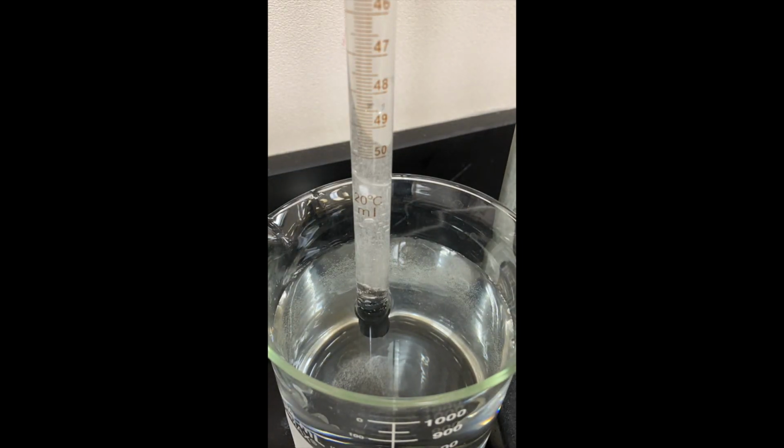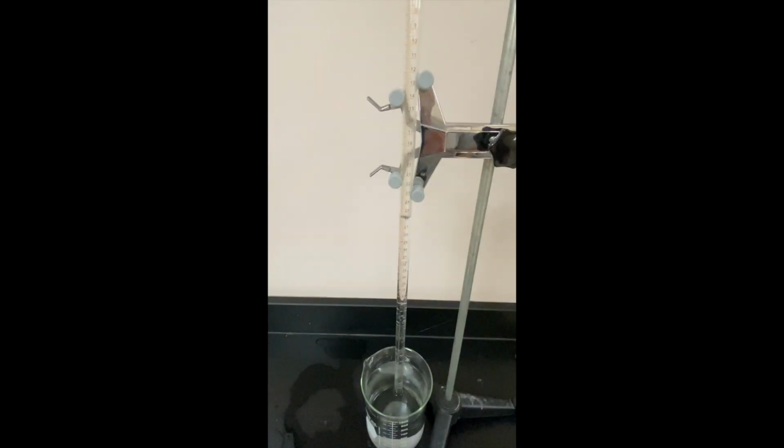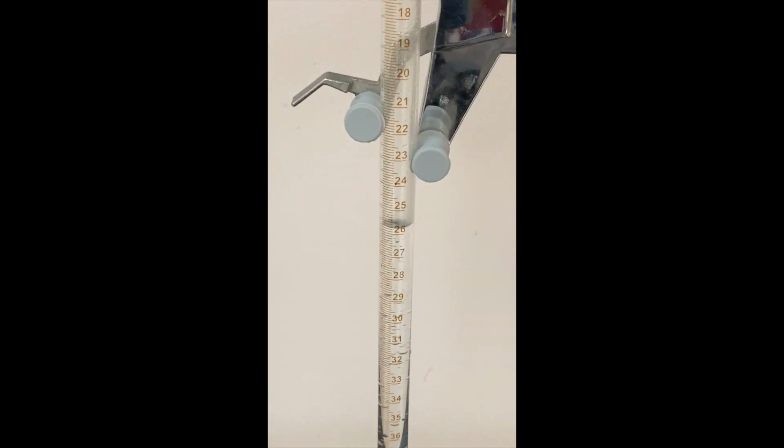All right, if we speed this reaction up, the magnesium and the hydrochloric acid react. You can see all of the bubbles. Once the bubbles stop, we know the reaction has stopped, and we can look at the volume of gas that we've collected. Now that the magnesium and hydrochloric acid have completely reacted, we can see all of the water that has been displaced by the gas. Now we're going to ensure that the gas pressure inside the tube is the same as the atmospheric pressure outside of the tube.